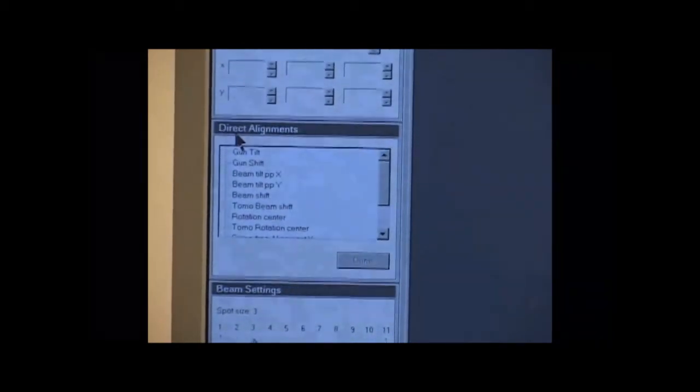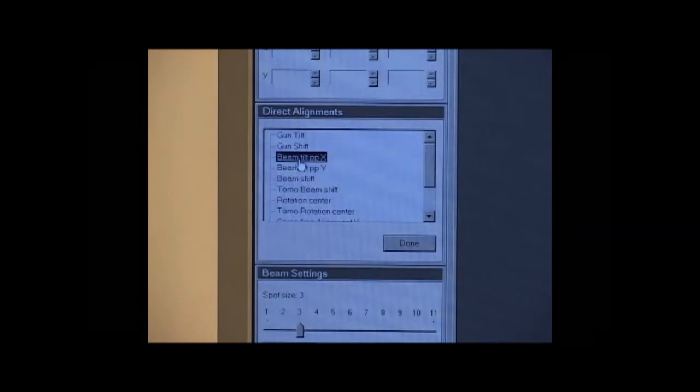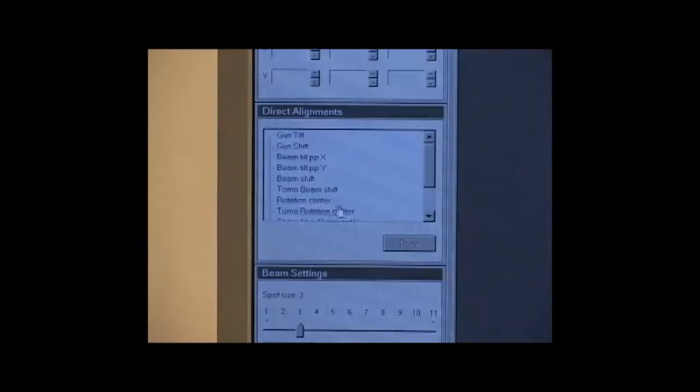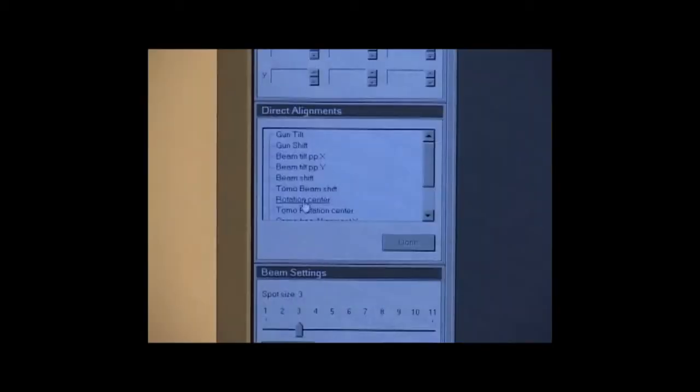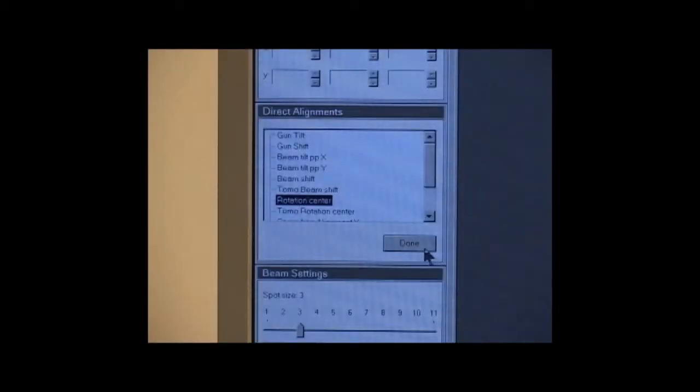Now we do Direct Alignments. Select Tune, User Interface, Direct Alignments, and Beam Tilt PPX. Notice that there appears to be two beams. Adjust multifunction X and Y until the two beams merge to one. Click Done to save this setting. Repeat the beam tilt P-P-Y and adjust the multifunction X and Y knobs until there is one beam image. Select Beam Shift and center the beam with the multifunction key, and then click Done. This saves the position of the beam so it can be recalled later if it gets lost. The trackball position cannot be saved. Select Rotation Center. The beam begins to wobble and the image moves. Adjust the multifunction dial until the movement of the image is minimized and the edge appears simply to go in and out of focus. Click Done to finish the direct alignments.